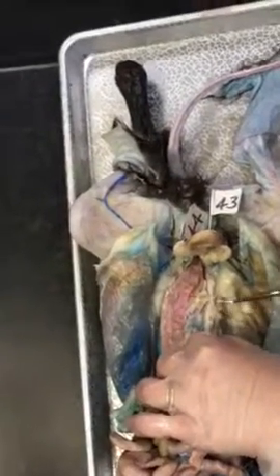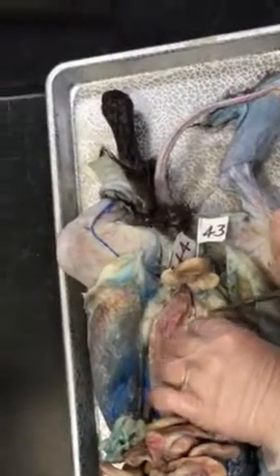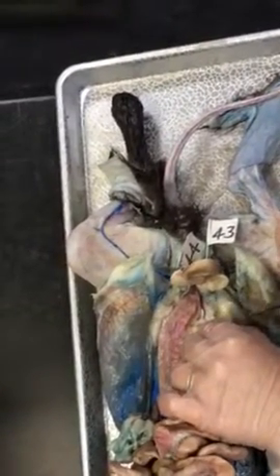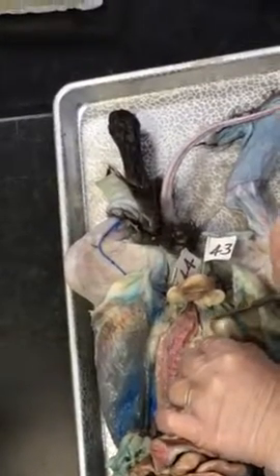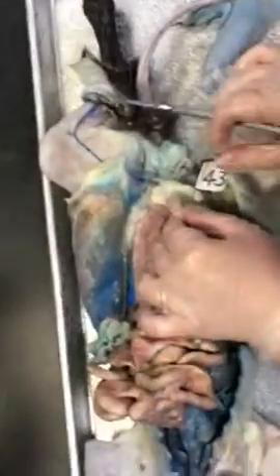All right, so we got this tube here running down. That's the ureter. It runs from the kidney down to the bladder. You can see it coming down here. Oops, tearing it in half there. I'm marking everything. This is the bladder right here. This deflated balloon.